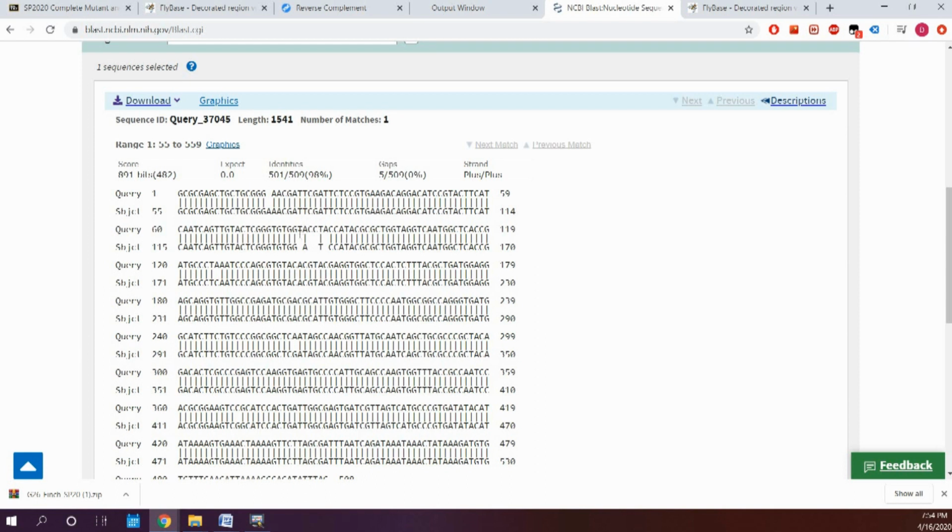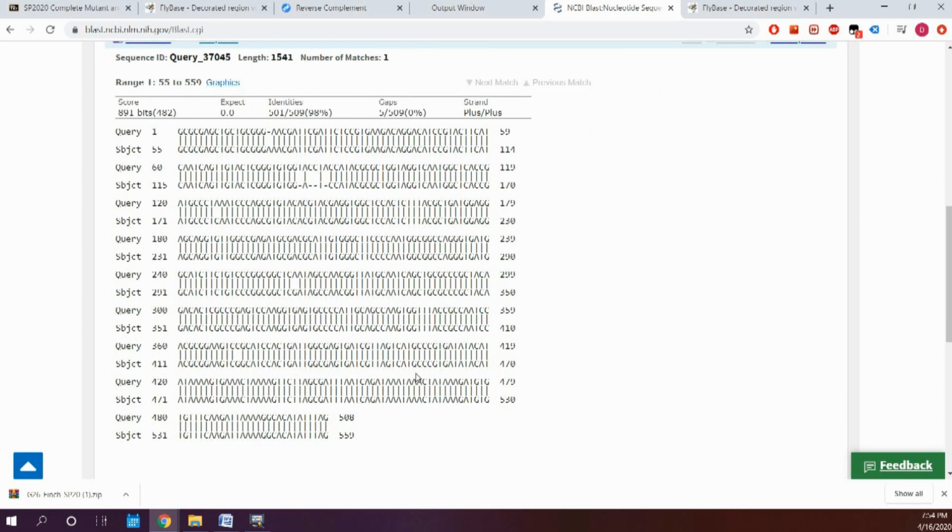Then here we might have insertions, right? So in the wild type, we don't have a T, we don't have these two C's, we don't have an A, but the mutant has the sequence. So the wild type does not have it, whereas the mutant does. And there's a couple of other ones that could be interesting. So here's another one. This is just a SNP, a mismatch. So in the mutant you have an A, but in the wild type you have a C.